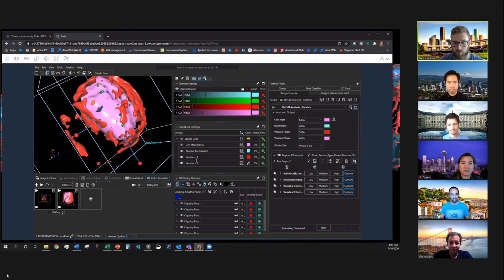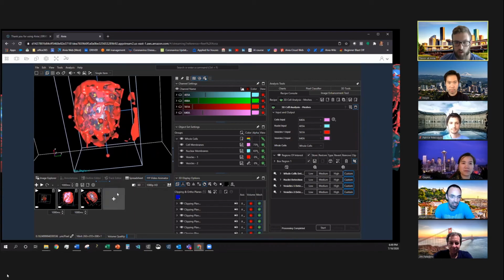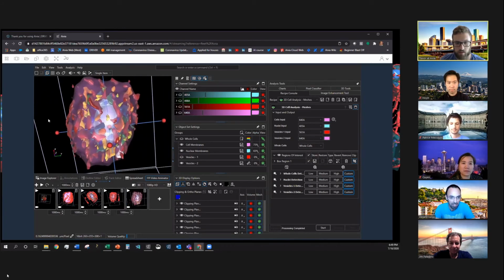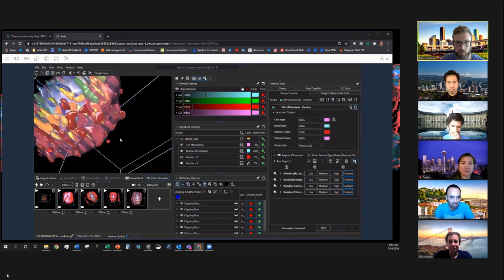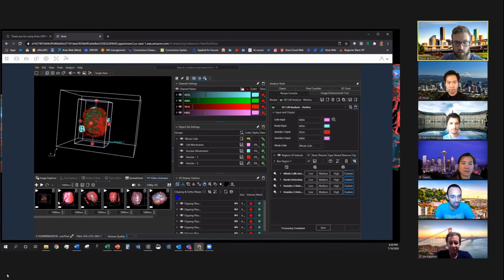And while I'm doing this slow rotation, I think I want to reveal that there are vesicles inside as well. So I'll go ahead and change the transparencies of these and add some more keyframes. And maybe rotate around, show a bit more. These vesicles on the outside are kind of obscuring things, so I can zoom in a little bit more maybe and continue with the rotations. And then finally at the end, maybe I want to make this looping, so I can click the first frame and then add that as another keyframe.